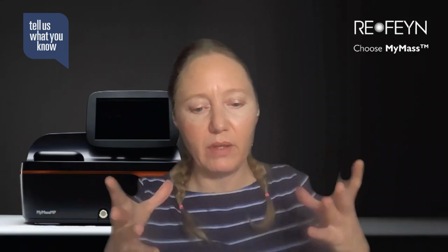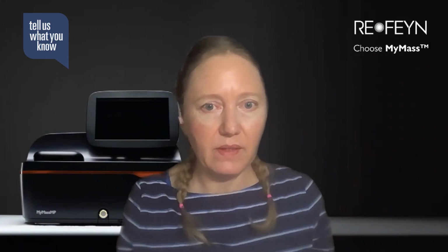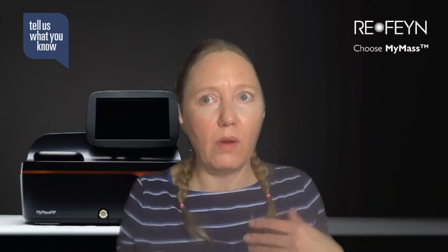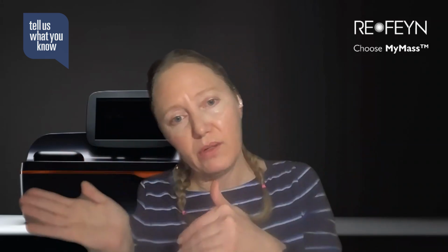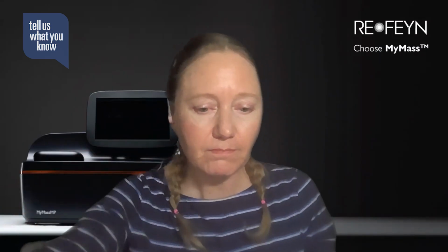And likewise, let's say you have a multi-component system with 3 different species. You might see all 3 of them and know that they're present, but you don't know if you have a 1-to-1-to-1 ratio or a 2-to-2-to-2 ratio; you cannot distinguish that. So that is one technique. And this is where SEC can play an important role.